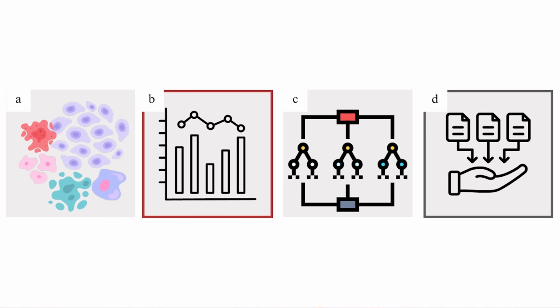Then the restoration and noise reduction that we already talked about, and even detection. You can detect some rare events or some atypical structures in the data. So no one has to go through one picture by one picture by one picture to do it for you. So it is very beneficial to use AI.